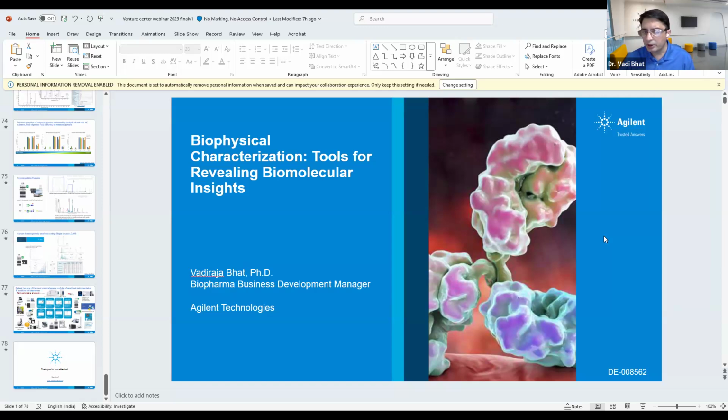HPLC-based analysis can do that, what we generally call an online LC PAT tool, a direct analysis of the sample. And in downstream, samples from the various stages of your polishing stage, at different fractionation levels, are directly sent to the HPLC along with the mass spec or single quad mass spec, and it can do a direct analysis, called an online LC PAT tool.